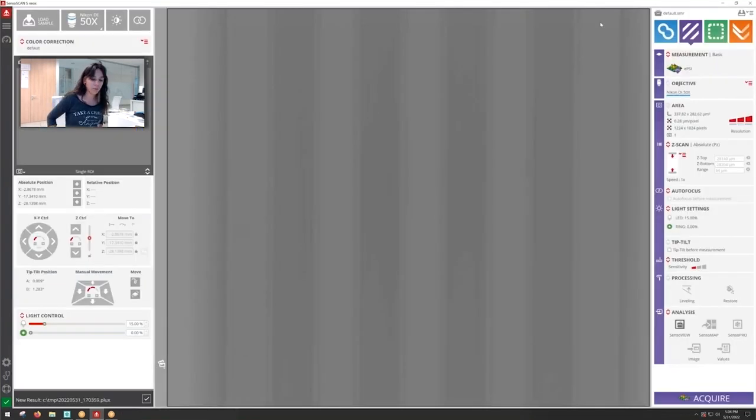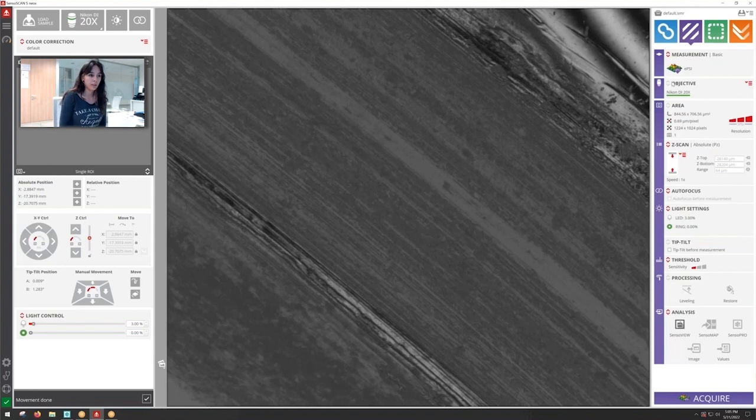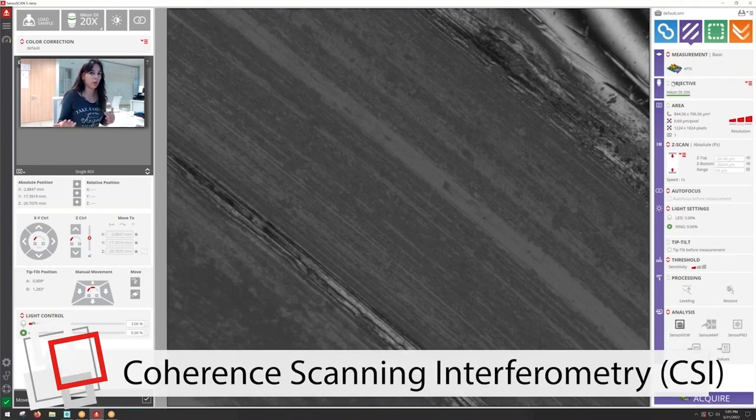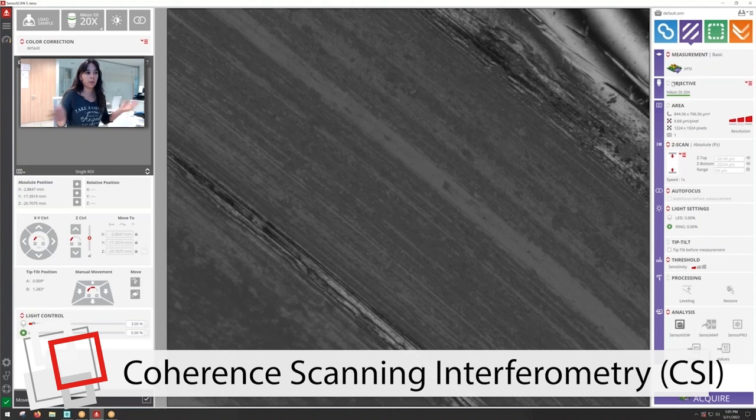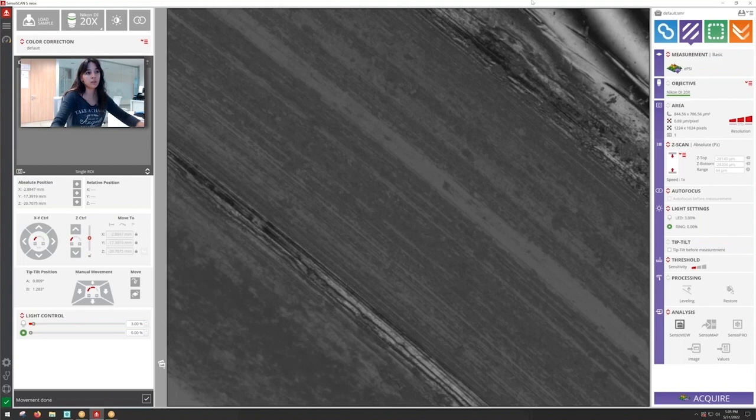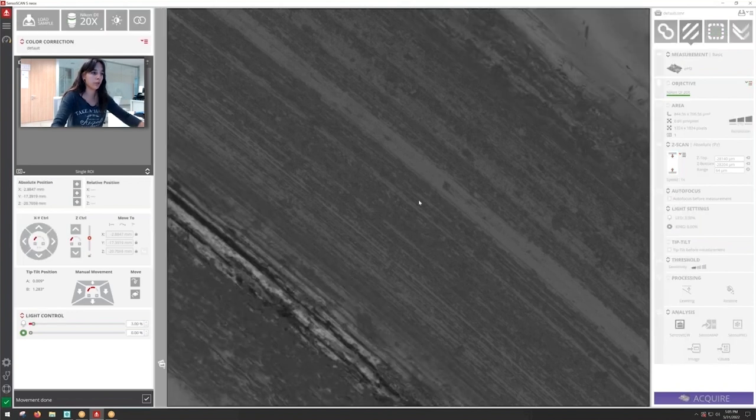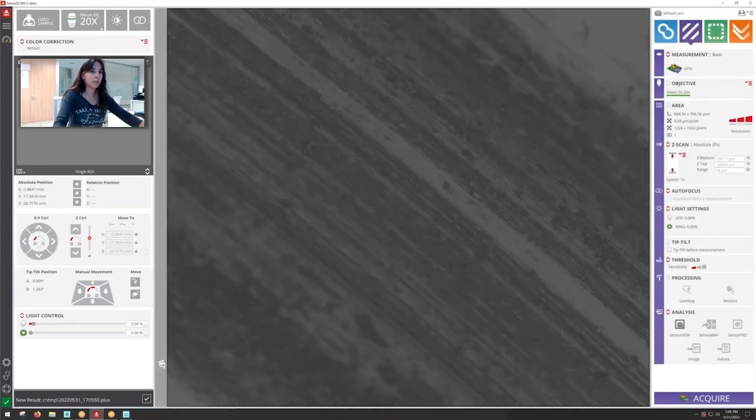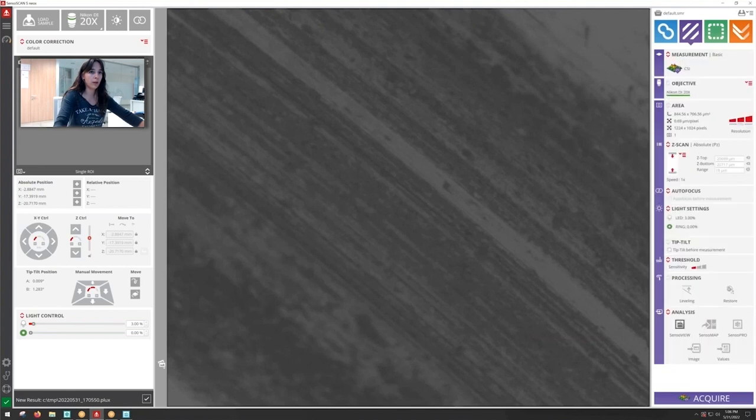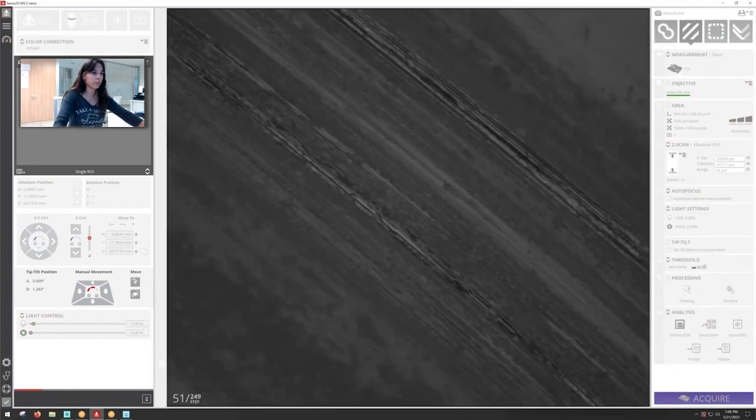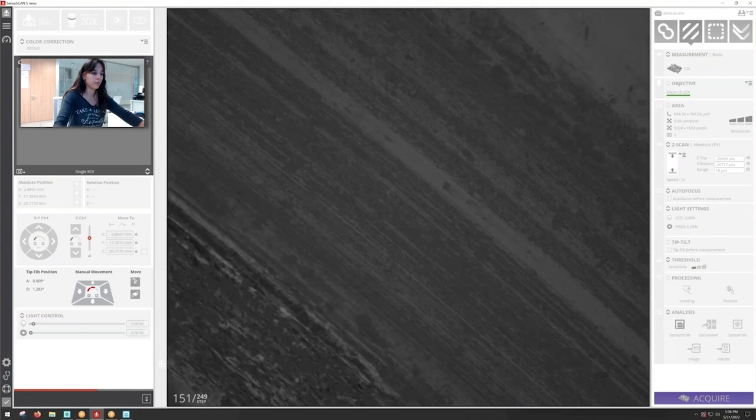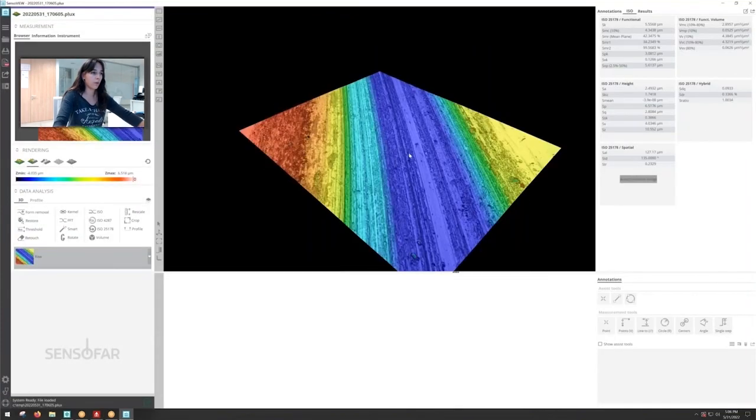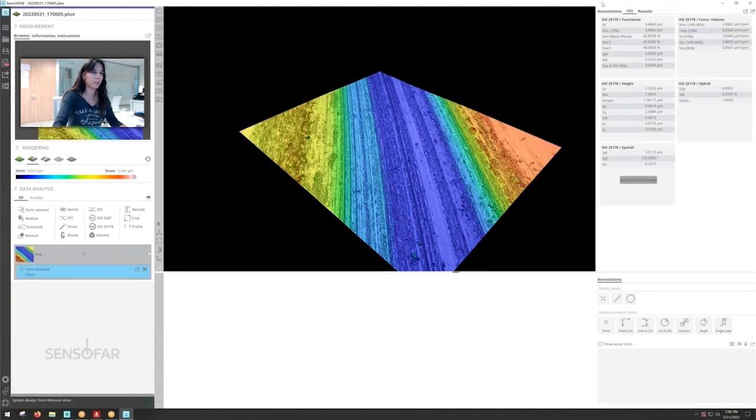And finally of course we have CSI. So CSI is going to be the most versatile mode in interferometry and it's going to be used in the other cases that PSI and EPSI are not used, such as for example to measure samples that are rougher. So let's change the mode and click acquire. And we'll have a beautiful image of our rough sample.